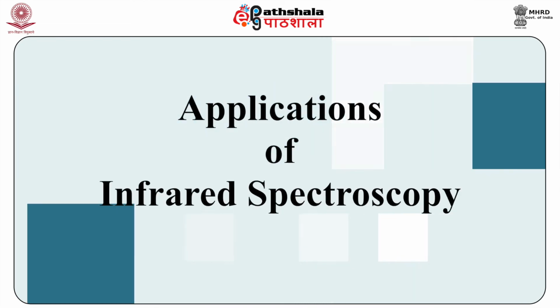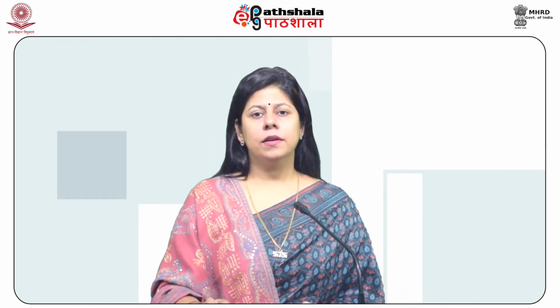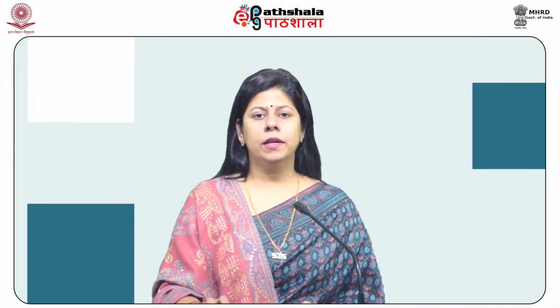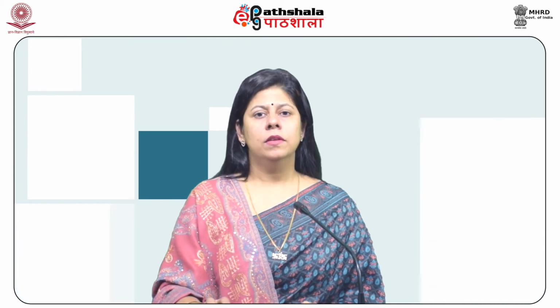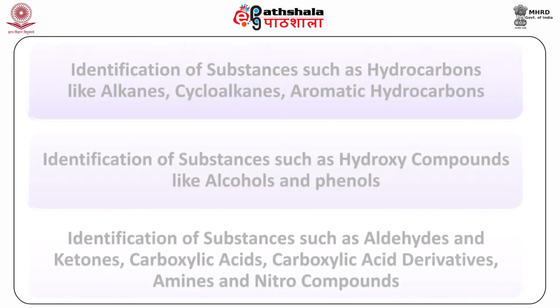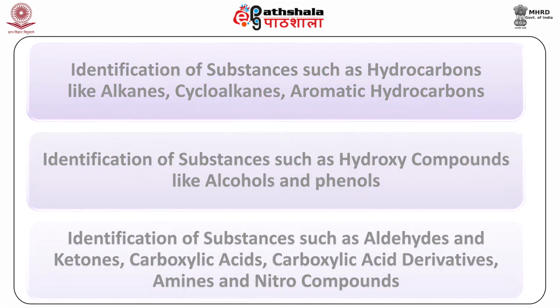Application of infrared spectroscopy. Identification of organic compounds. The infrared spectrum is a highly characteristic property of a substance, and the examination of an infrared spectrum can aid chemical investigation in many ways. The important applications of infrared spectroscopy are given as follows. Identification of substances such as hydrocarbons like alkanes, cycloalkanes, aromatic hydrocarbons. Identification of substances such as hydroxy compounds like alcohols and phenols. Identification of substances such as aldehydes and ketones, carboxylic acids, carboxylic acid derivatives, amines and nitro compounds.